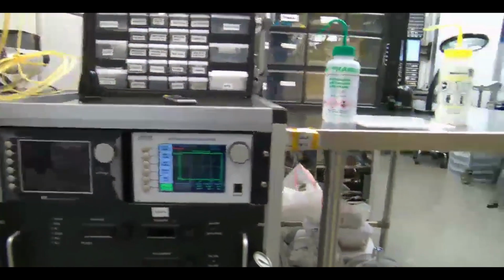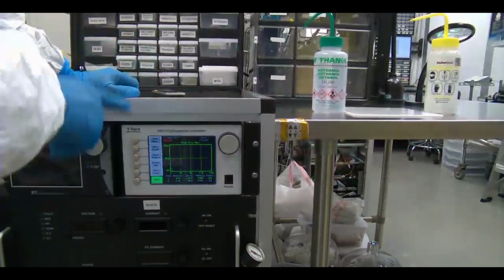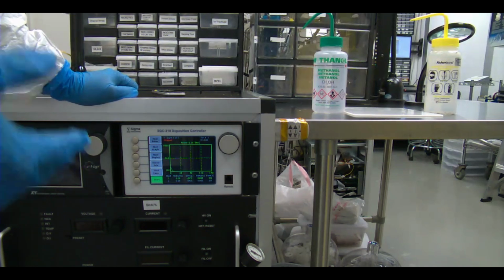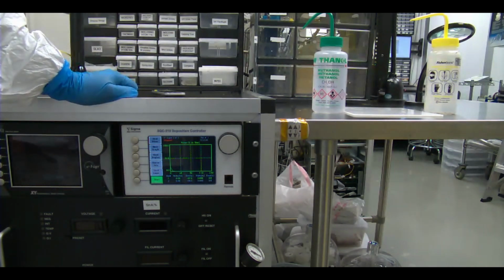This one here monitors the deposition rate. And the deposition rate monitoring is based on a quartz crystal. You measure the acoustic frequency that's oscillating inside the quartz crystal. That acoustic frequency is modified by the deposition. So as the crystal gets heavier, the resonant frequency drops, and you can measure that resonance frequency, and that's what this is doing.